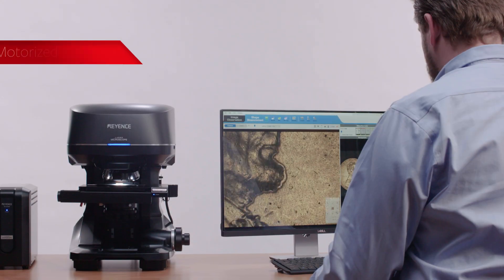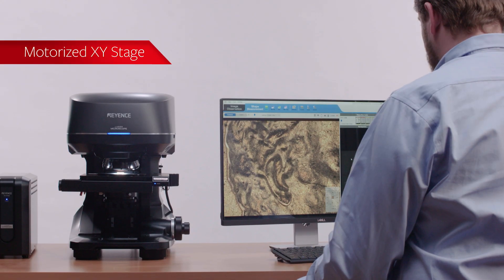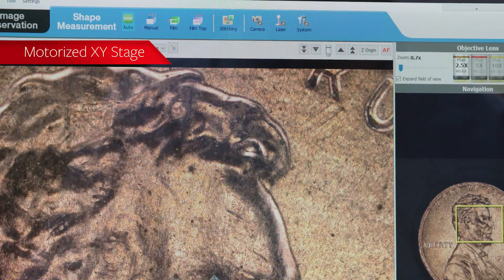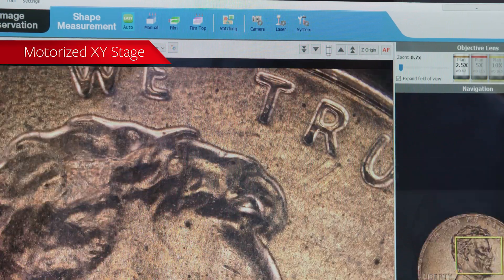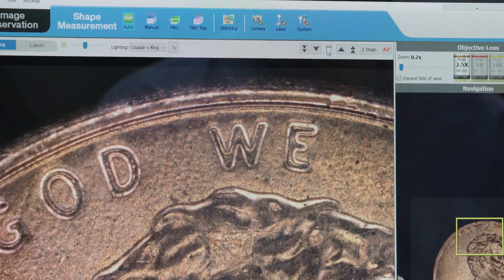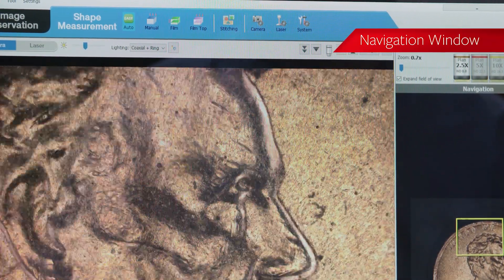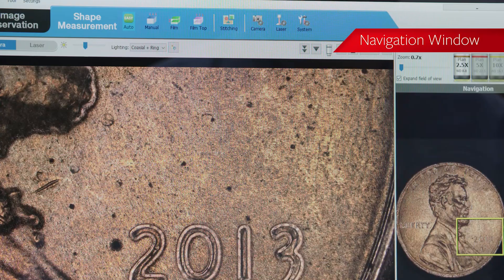A motorized XY stage allows users to easily move to the location of interest on their sample, while a navigation window gives an overall view of the part.